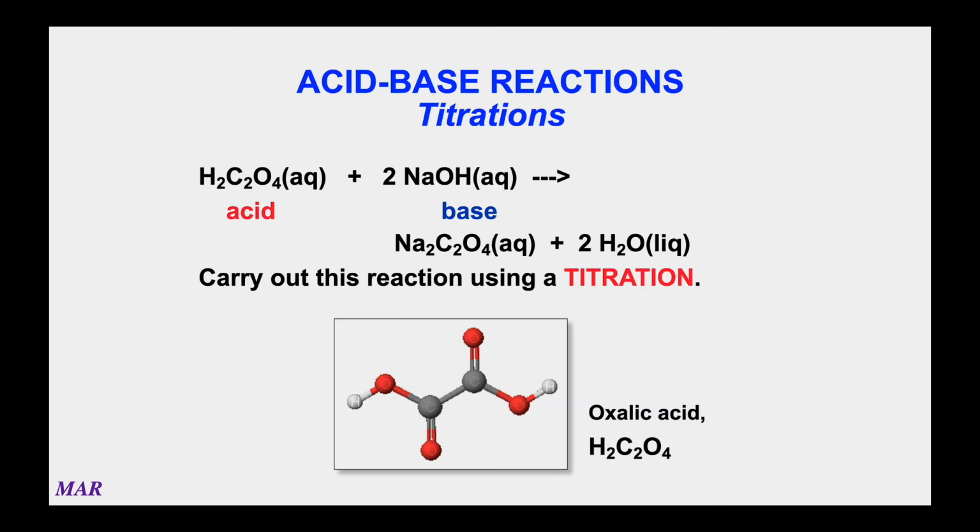And I'm very proud that at Mount Hood Community College, where our funding is not always the greatest, we can do a titration with just as much accuracy, I would argue, as people at MIT and Caltech, because it all revolves around a burette, which we have. They have them too. It's a pretty cool thing. So titrations are kind of neat.